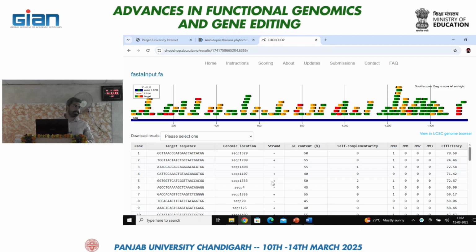No, not necessarily. It can be the negative strand as well, because our CRISPR RNA or this target region will simply bind at the particular location, and the Cas9 will introduce a nick there. So it doesn't matter whether it's in the positive strand or in the negative strand. So you can choose either. So let me conclude everything. So yes.